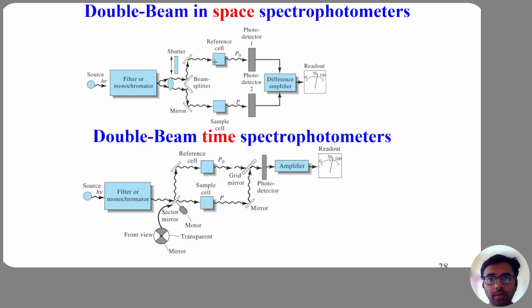In the last lecture, we studied the single beam spectrophotometer and we discovered a fundamental limitation. The accuracy of the instrument depends entirely on a perfectly stable light source. During measurement, we manually swap the reference cell and sample cell. Even a tiny fluctuation in lamp intensity during this short interval invalidates the absorption data. This is not a minor inconvenience, it is a fundamental physical weakness.